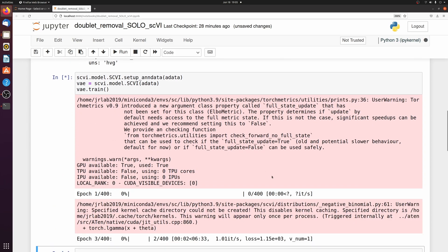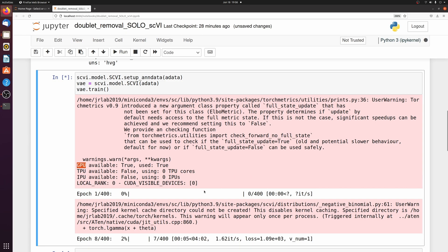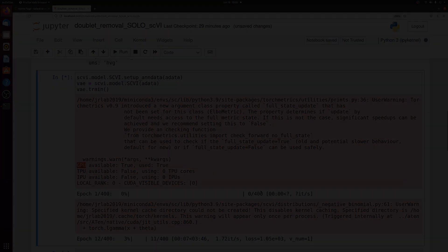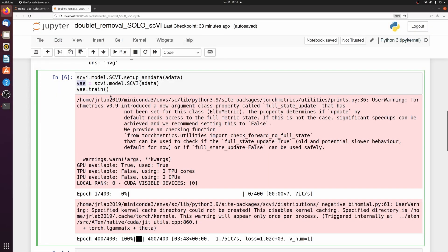This is going to take a few minutes, especially if you don't have a NVIDIA GPU it could take even longer. Okay, so my scvi model trained after a few minutes.